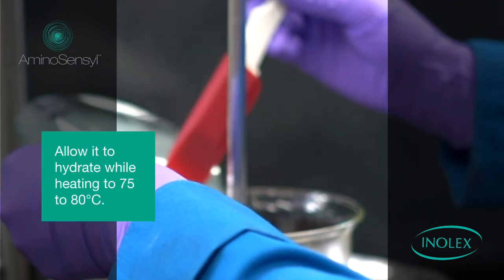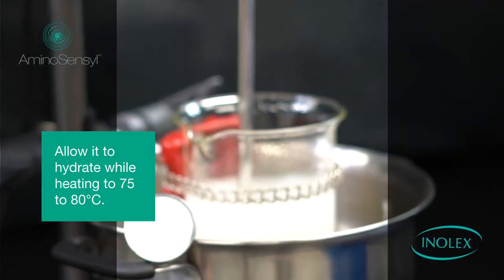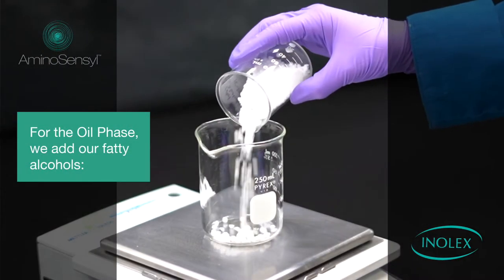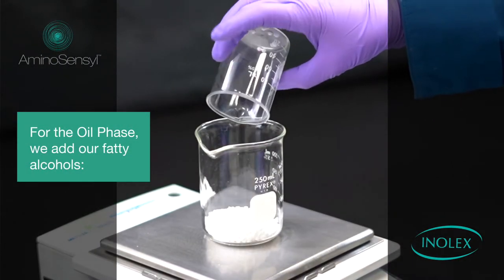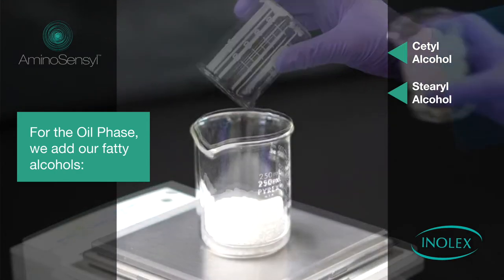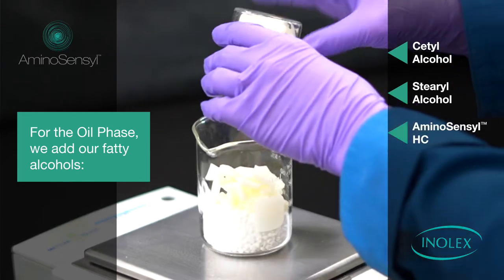Allow this to hydrate while heating to 75 to 80 degrees Celsius. For the oil phase, we add our fatty alcohols — cetyl alcohol and stearyl alcohol — to thicken the formula. Then, we add our main emulsifier and conditioning agent, Aminosensyl HC.